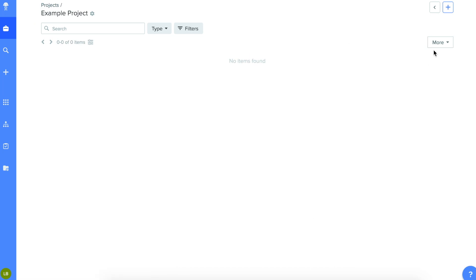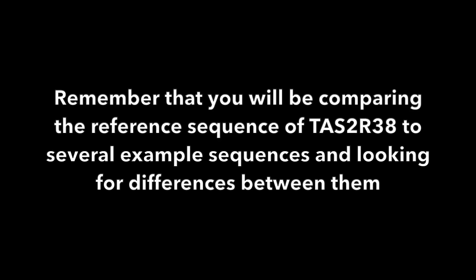Now you can begin to analyze your DNA sequences. Remember that you'll be comparing the reference sequence of TAS2R38 to several example sequences and looking for differences between them.